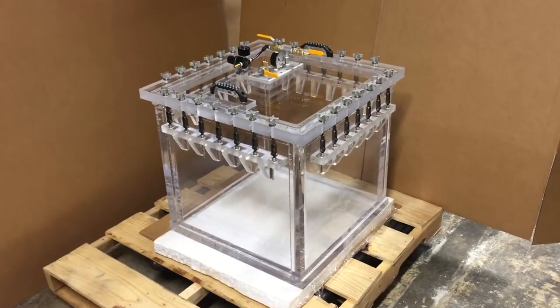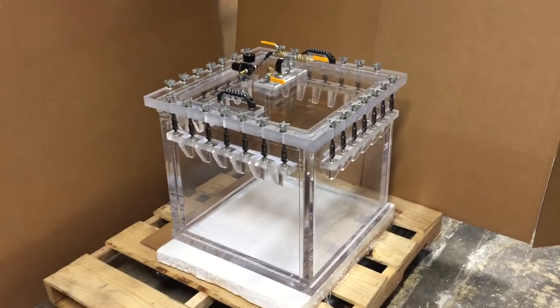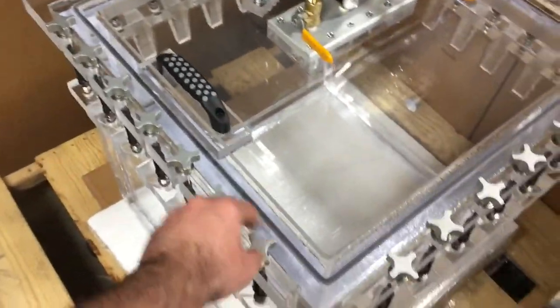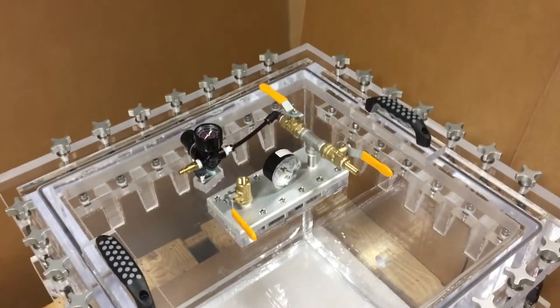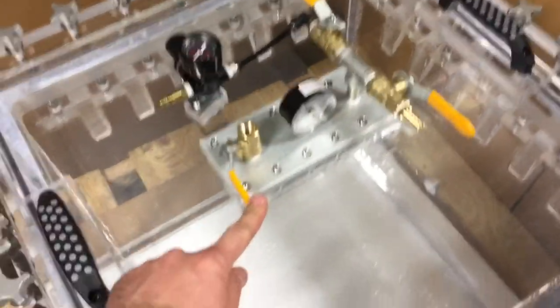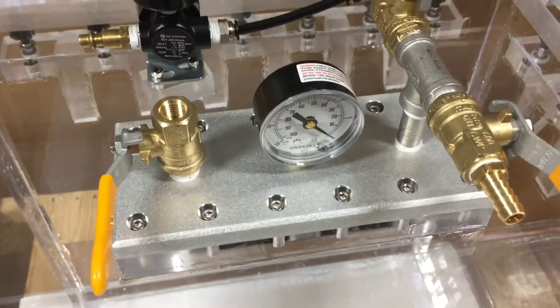This is your acrylic vacuum pressure chamber. It has essentially two handles and 27 thumb screws which clamp the lid when you pressurize the chamber. It has a pressure regulator, a vent valve, a vacuum valve, a pressure valve, and of course your vacuum gauge.